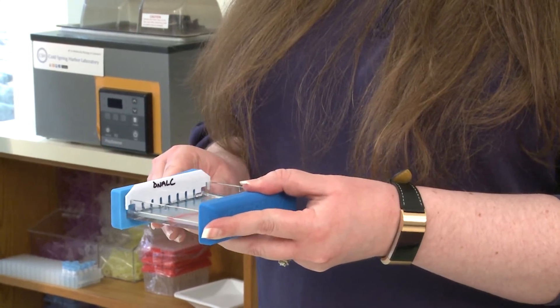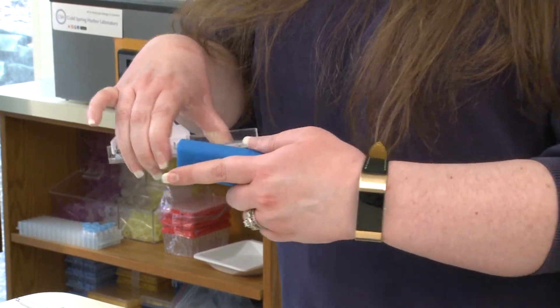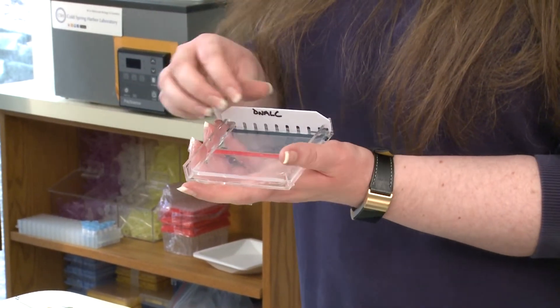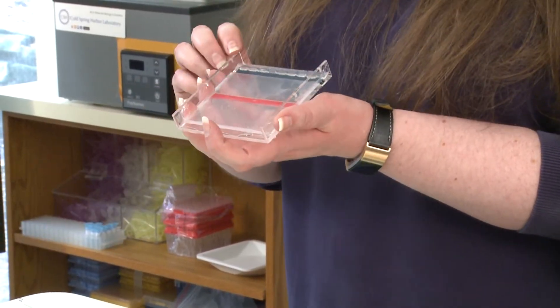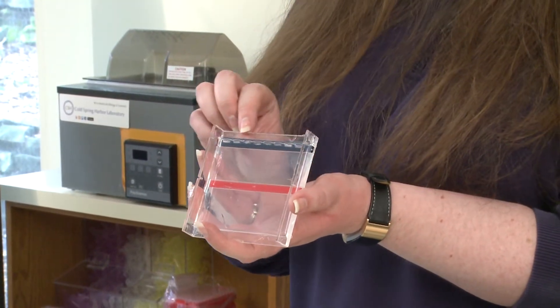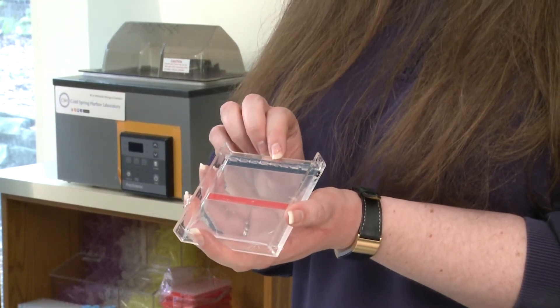You're going to remove the stoppers from your casting tray, and you're going to remove the comb. Remember, the comb's purpose was to give us these slits inside of our gel. These are our wells, which is where we will load our DNA sample.